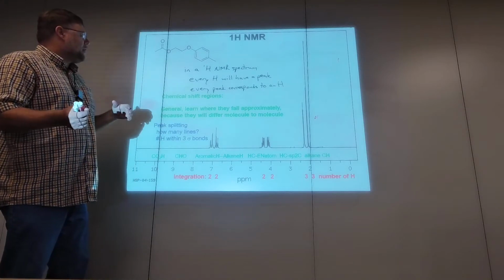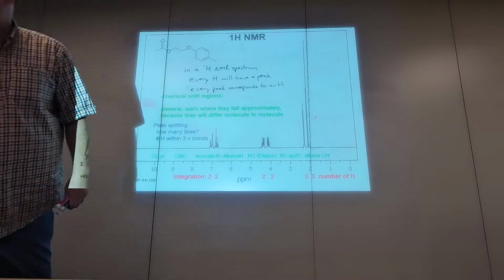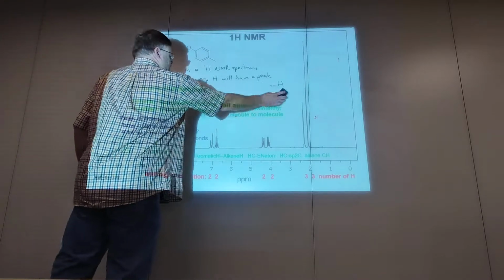So what I wanted you to do at the end of the last video is tell me which peak corresponded to which protons. And again, if you haven't done that yet, you should do it before you see the answer at the end of this video.